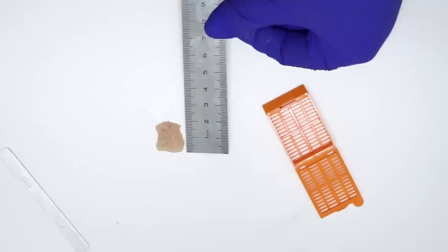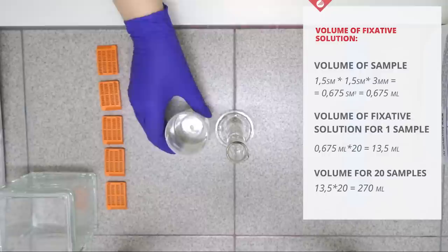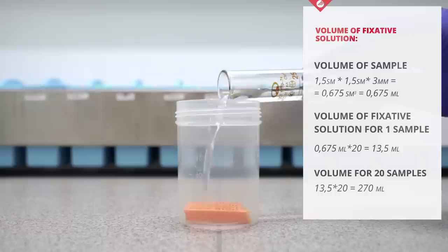The volume ratio of the material and fixative solution should be 1 to 20. For example, if your sample has a volume of 675 µL, then you need to add 13.5 ml of fixative solution. If you have 20 samples, then you need to use 270 ml of formalin. You can always count the amount of formalin that you need for your work.